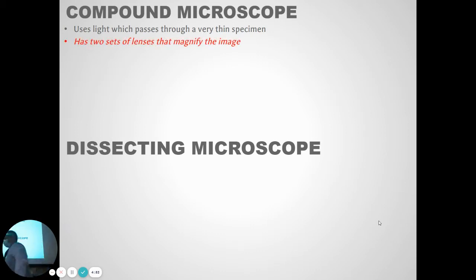You guys used these in 7th grade, right? All right, so this is review, but these are compound microscopes. They have a lens here in the eyepiece, and a lens here in the nose piece that you can select different powers of. They both magnify the image at the same time. This lens magnifies the image a certain amount, and then the light gets to this lens and it magnifies it even more. That's why these compound microscopes can give a pretty high magnification.